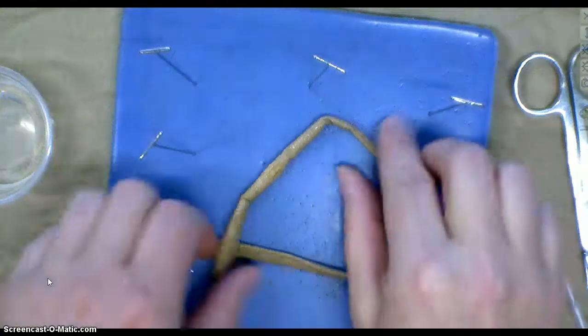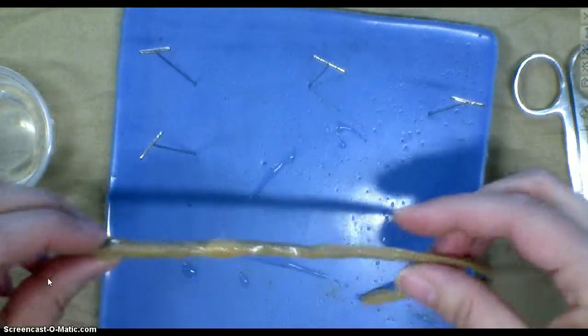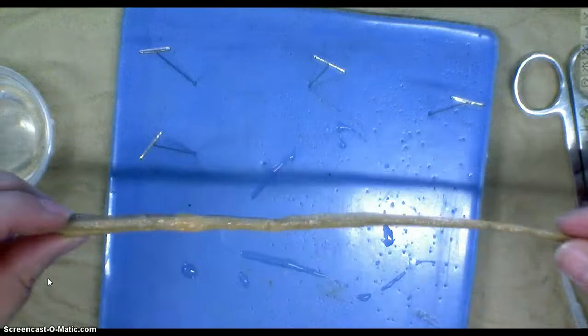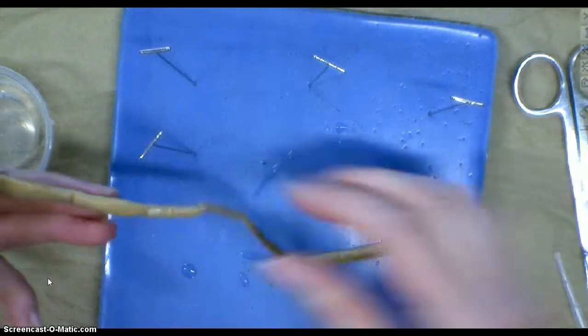All right, this is the beginning of what we would do for a dissection for a worm. So here is a worm. I've just pulled it out of the bucket.